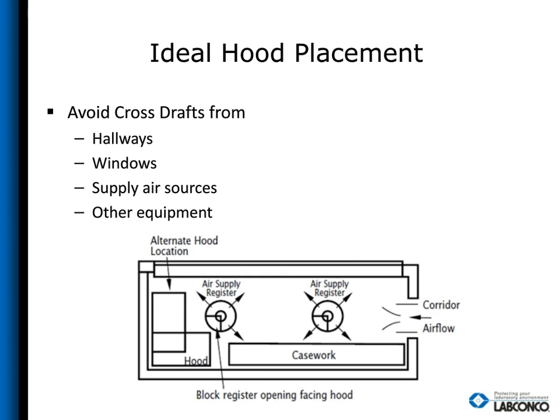So remember, if the lab has proper ventilation and minimized cross drafts, then a high-performance fume hood should have no problem operating at 60 feet per minute with the sash fully open. It should pass all the ASHRAE containment tests and will be able to save so much money and energy costs at the end of the day that the hood will pay for itself.